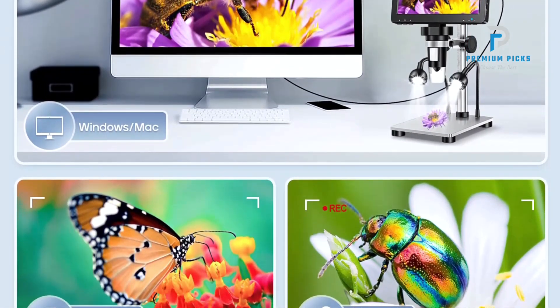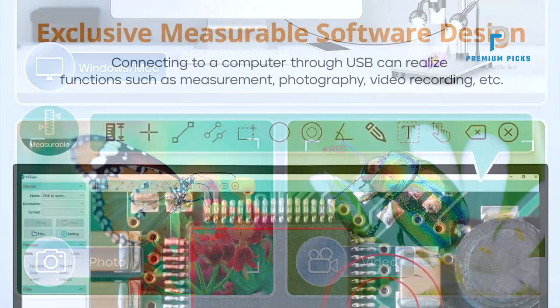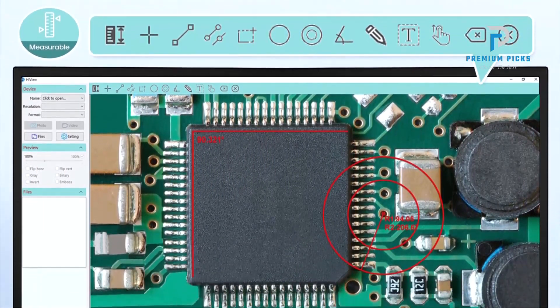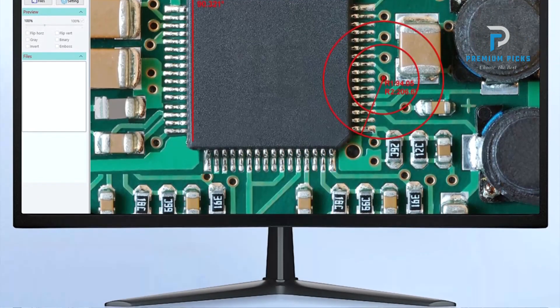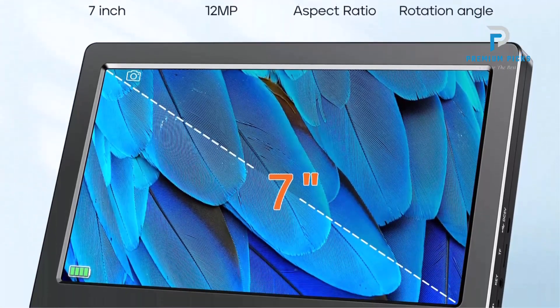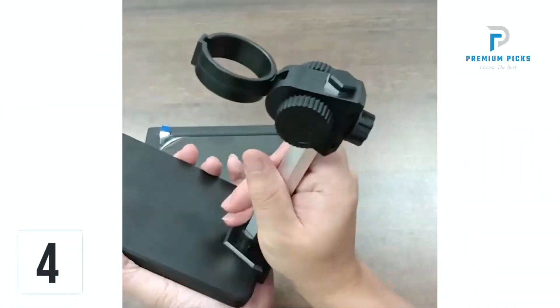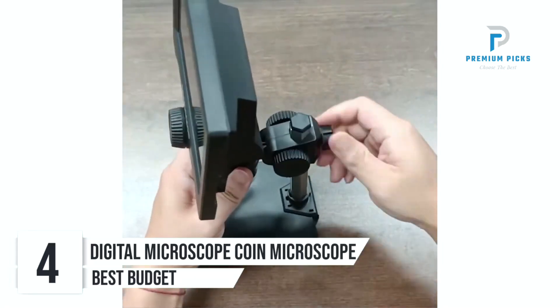User-Friendly Design: The microscope features a manual focus mode and supports digital zoom, providing users with full control over their observations. Its large 7-inch LCD screen offers a wide field of view and adjustable angles for enhanced visual clarity and comfort. With 8 adjustable LED lights, the DM9 illuminates specimens evenly.